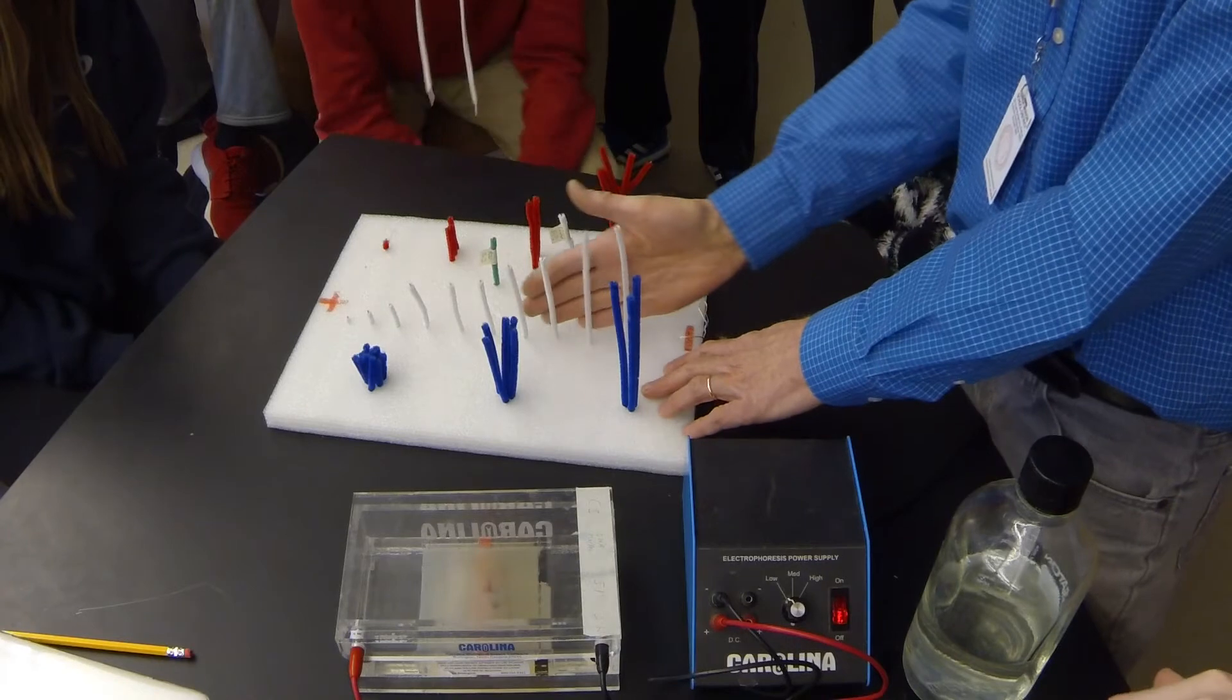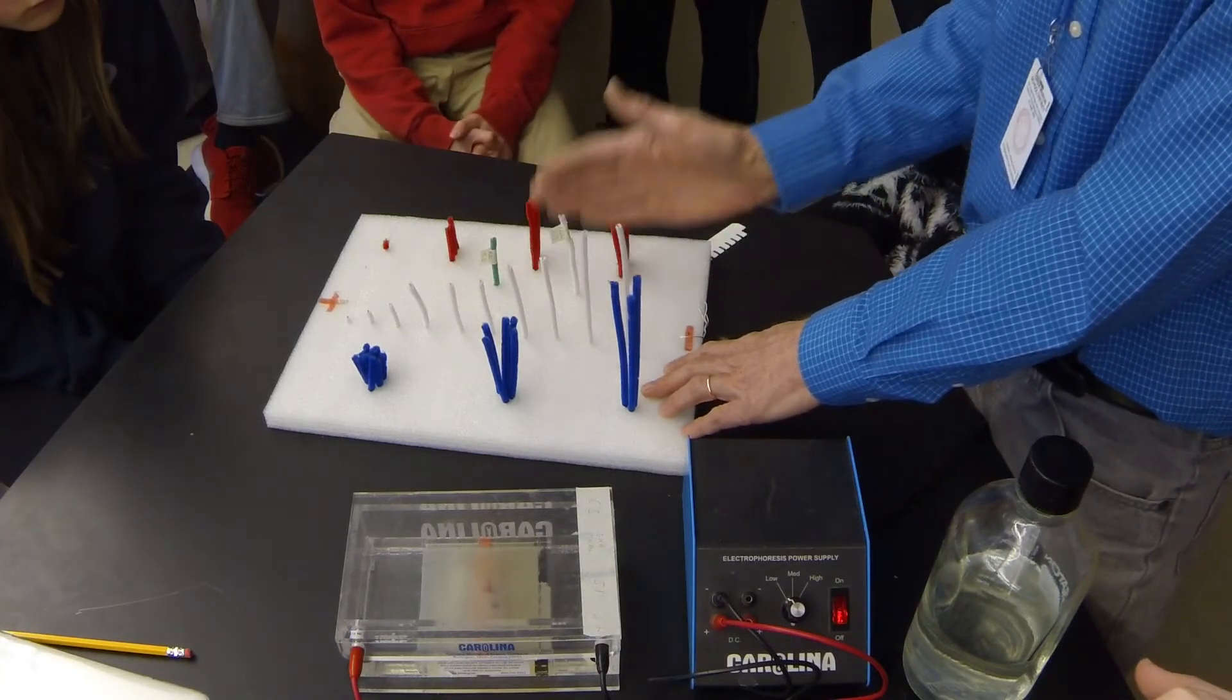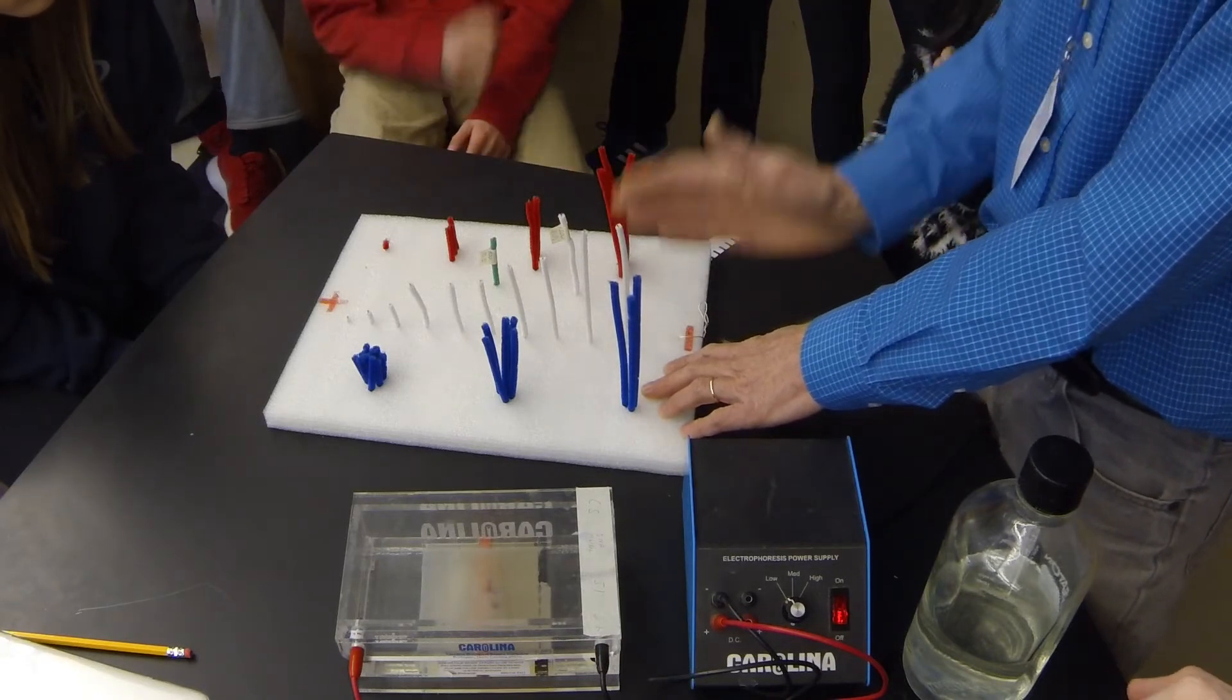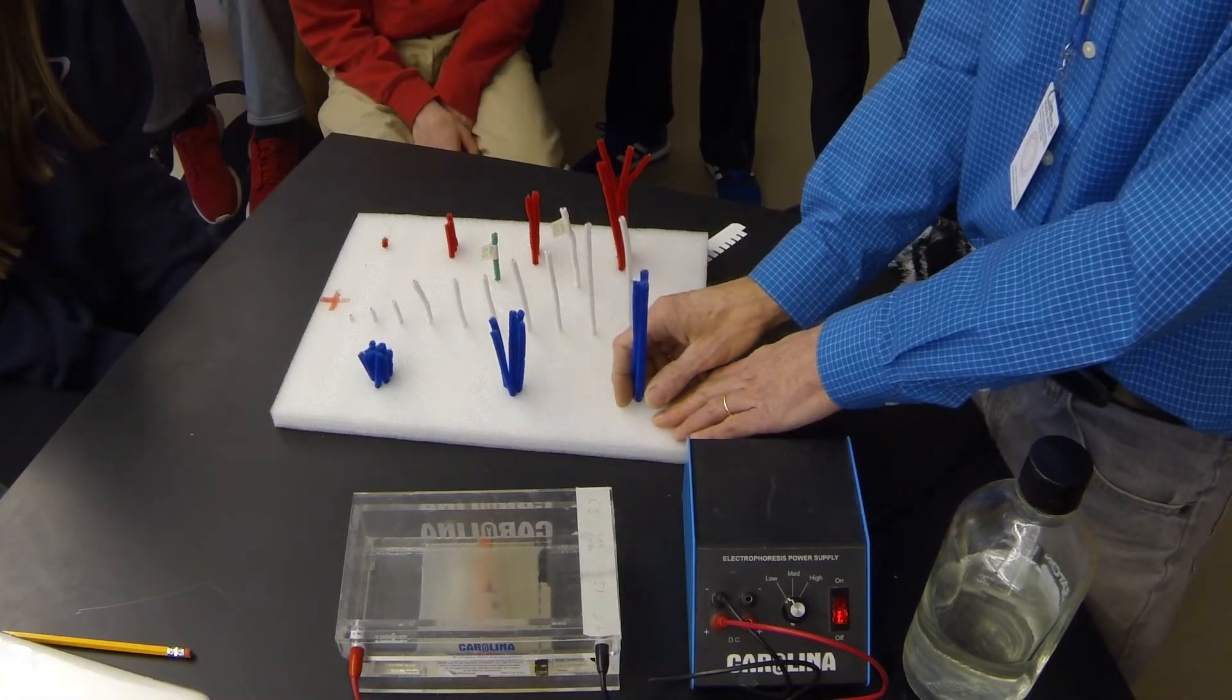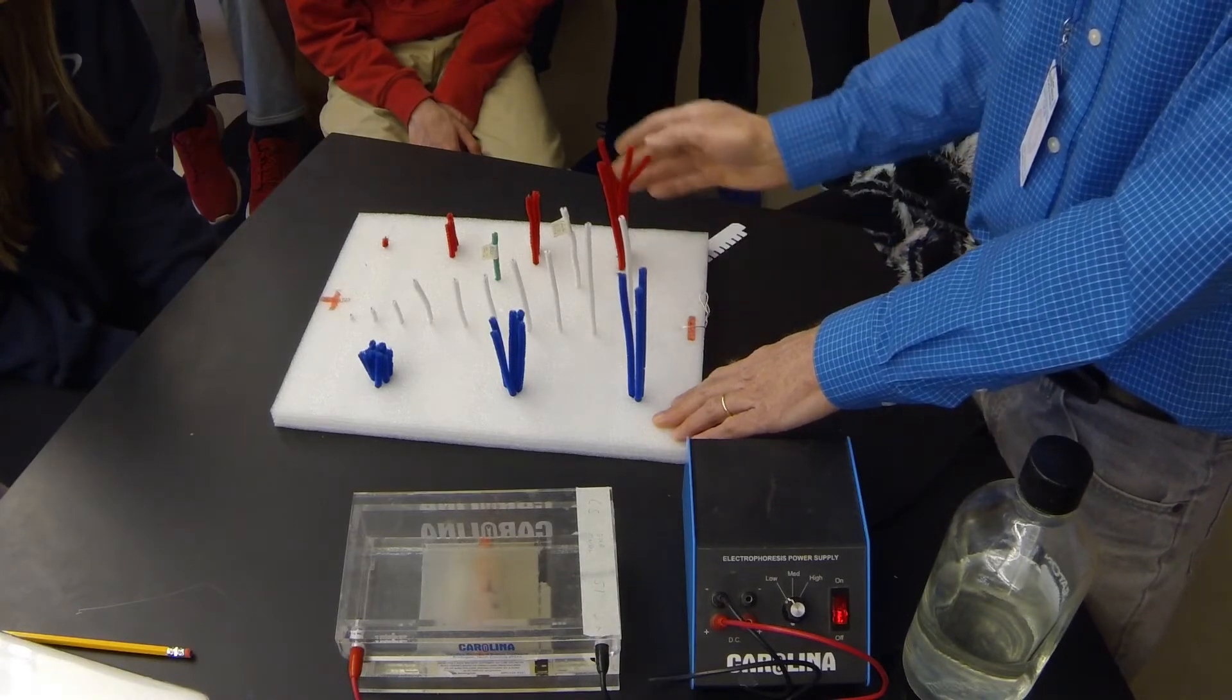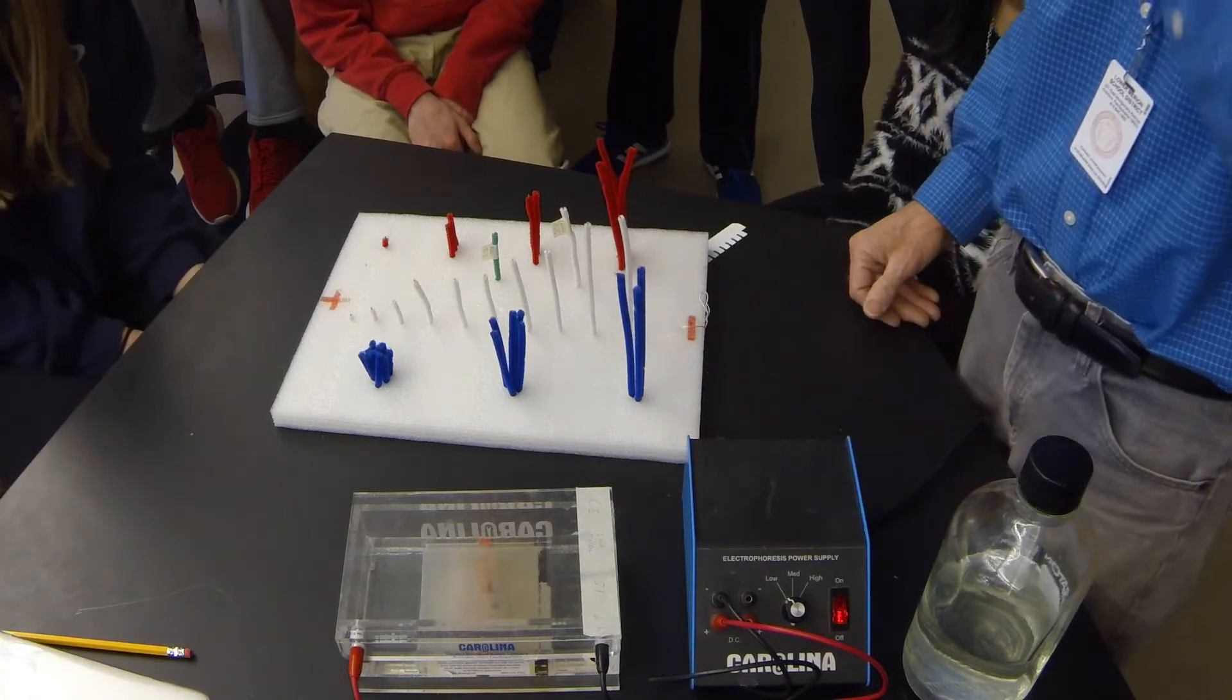Now this is called the DNA ladder. It's like a visual boundary, like a fence, to separate this sample from this sample so you don't get too confused. This is just junk DNA that means nothing other than a visual boundary. Notice that the sample I got off the laptop does not match Emma's sample. So Emma is not a suspect in this crime.